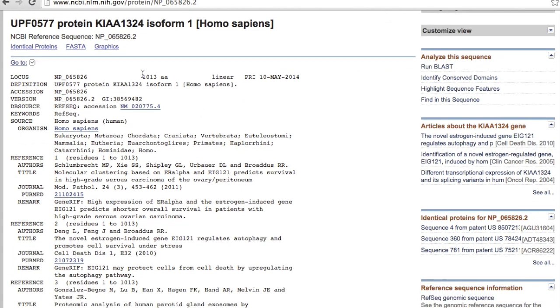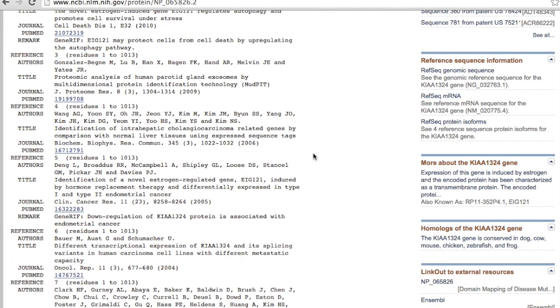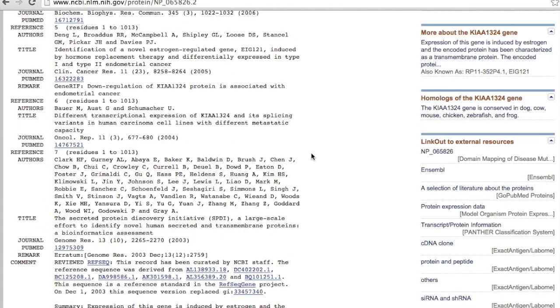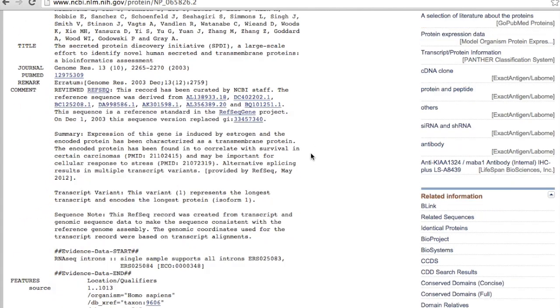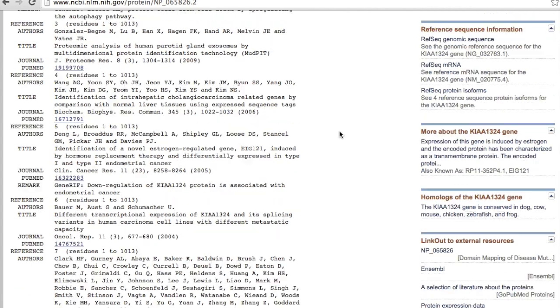It has 1013 amino acids and it is a transmembrane protein.